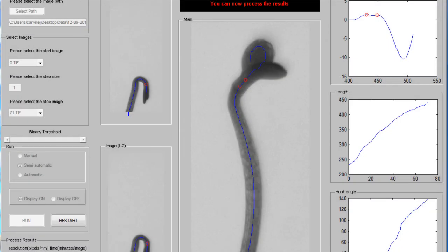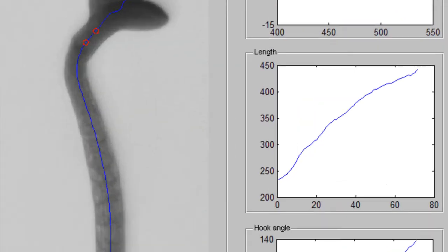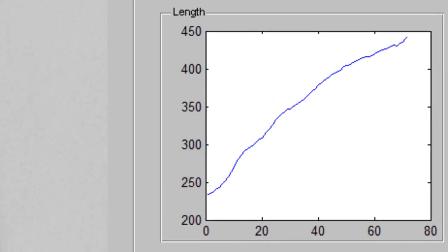Continue making image selections until each image in your image stack has been analyzed, then save your results. When completed, a good data set will give a smooth length curve. A length curve with large spikes or drops indicates that endpoints were selected incorrectly at some point during the analysis.